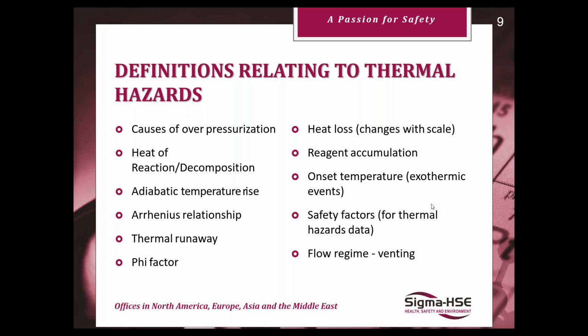Onset temperatures are going to be an important one for the differences between quick screening tests and also adiabatic tests. Safety factors, again, are a key difference between the screening tests and the adiabatic tests. And then also a little bit to do with flow regime and venting, emergency relief systems.